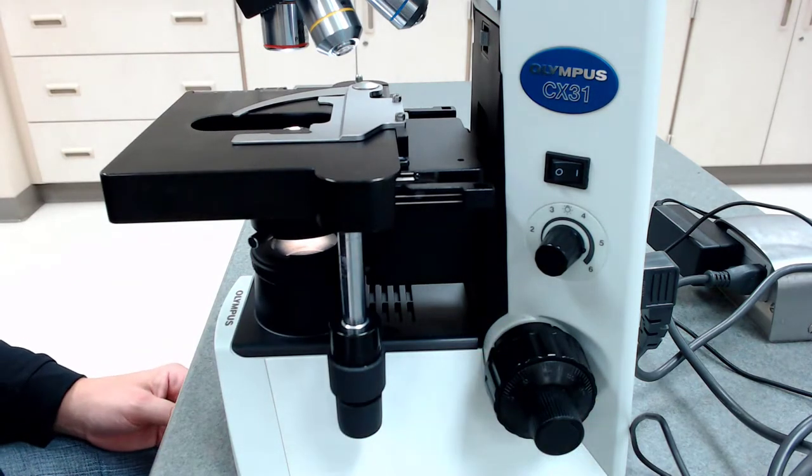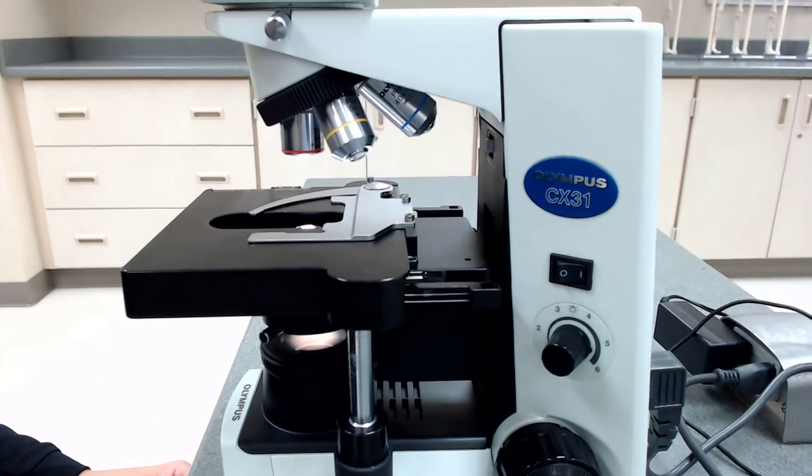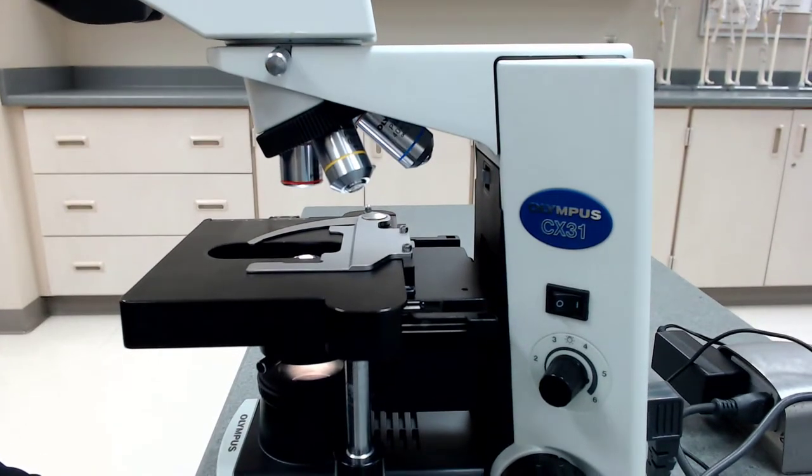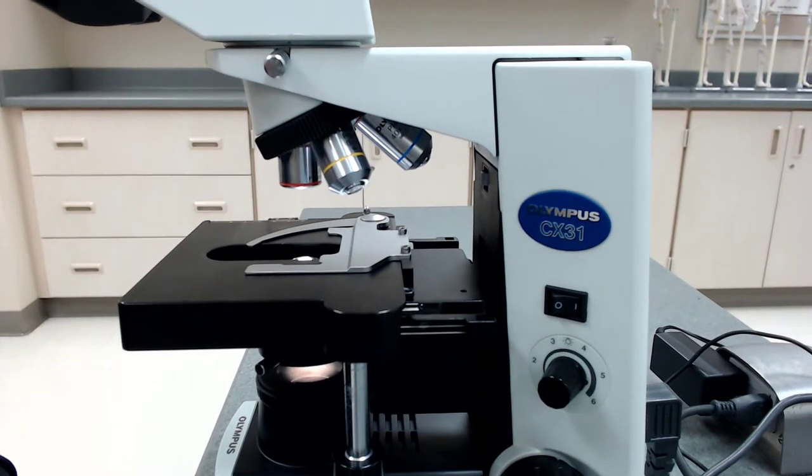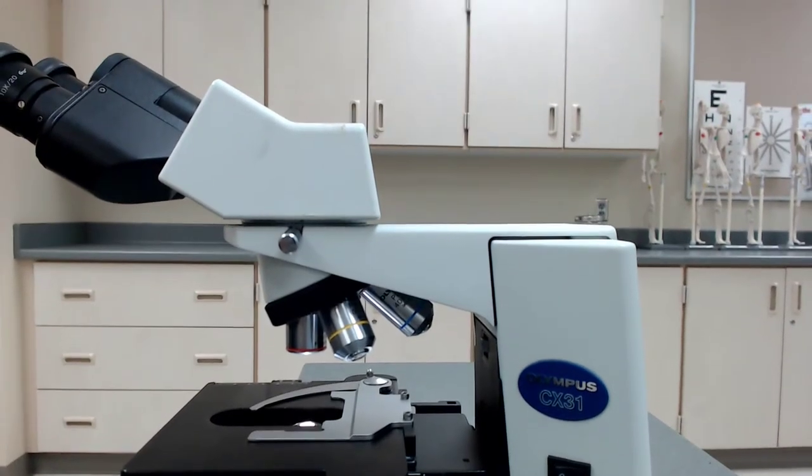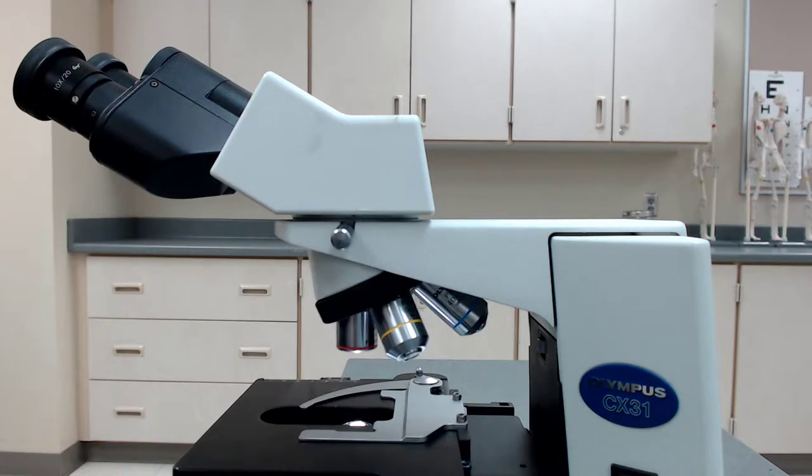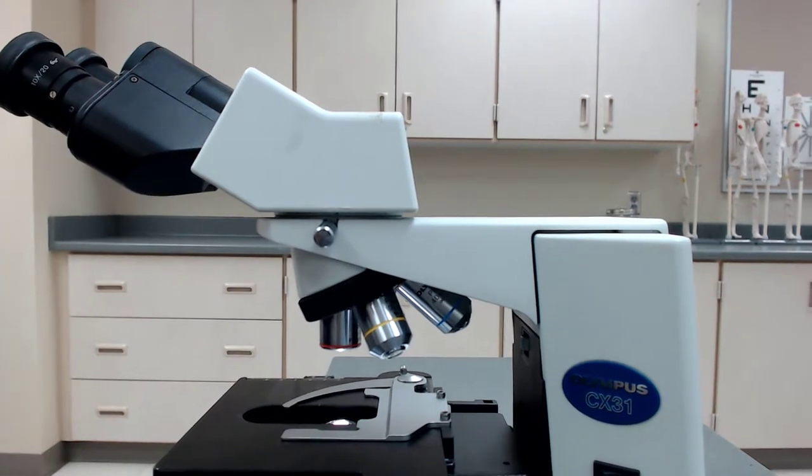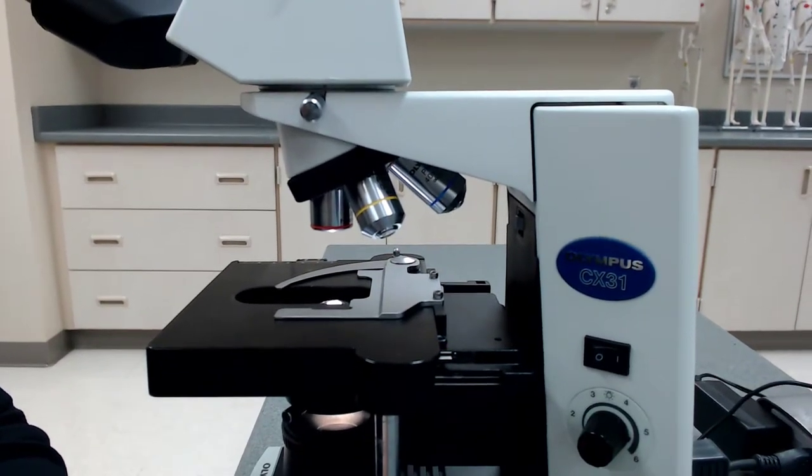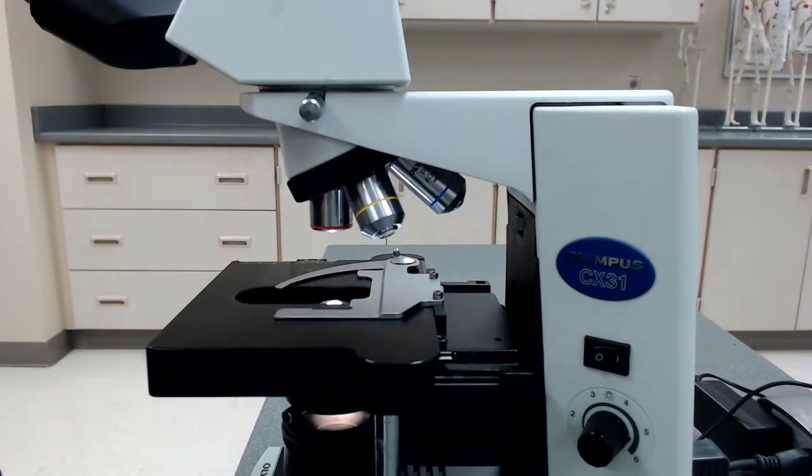Now let's go up a little bit higher and take a look at the objectives. So here, this is a binocular parfocal compound light microscope. So it's binocular because it has two eyepieces up here. Instead of, you know, traditionally microscopes only had one. I personally still only use one, so it's up to you.